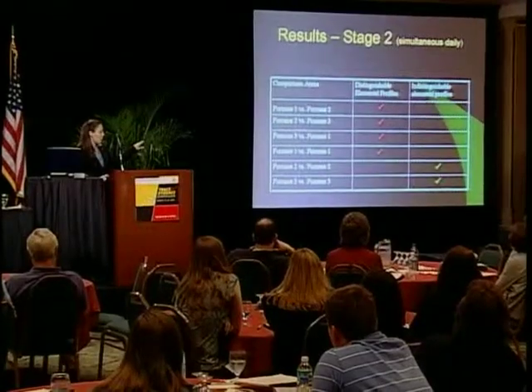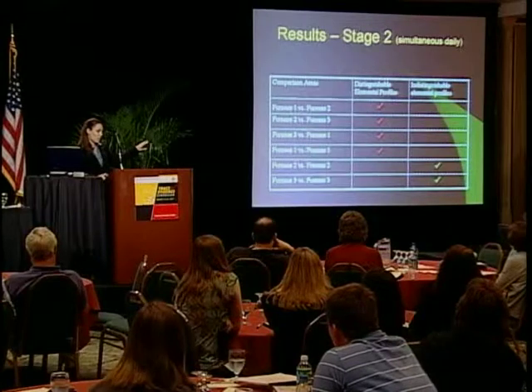We were actually on time constraints due to when we had to submit the paperwork for this presentation. So we only had 6 bottles to work with for this. We had 2 bottles from furnace 1, 2 bottles from furnace 2, and 2 bottles from furnace 3. And as you can see, when we compare the furnaces to each other, they're all distinguishable. And when you compare the furnace 1 bottle to the other furnace 1 bottle, they were also distinguishable.